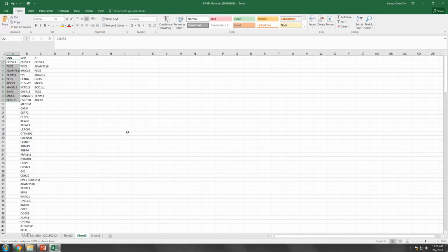What I'm going to do next is look at what these 10 classifiers that we identified do, what their biological function is, and what pathways might be affected. There are a couple of software tools you can use to run the pathway analysis, and I'm going to show you a few of those. The good thing is that almost all of this can be done online by connecting to the database and the online software. So I'm going to copy the 10 stable classifiers that we identified from the model.